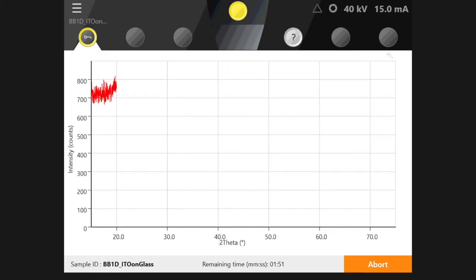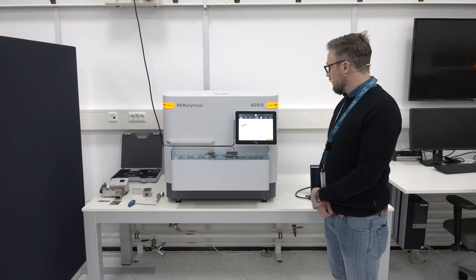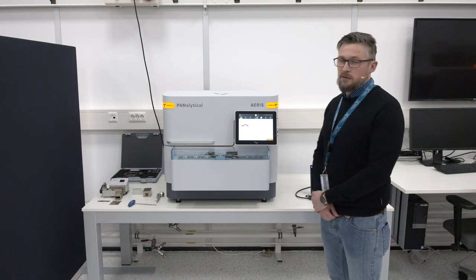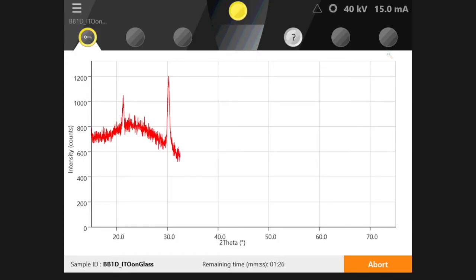The measurement is now running and the data is being generated. As you can already see in the beginning of the measurement, you get small peaks — those are the peaks of the thin film — but you also get a very high background, and that is actually the signal that comes from the glass substrate. The signal from the substrate is a result of the larger penetration depth that we have in this beam geometry into the sample itself.